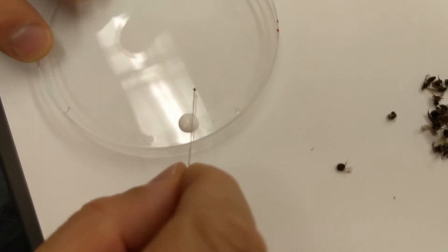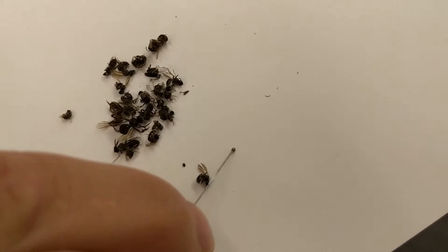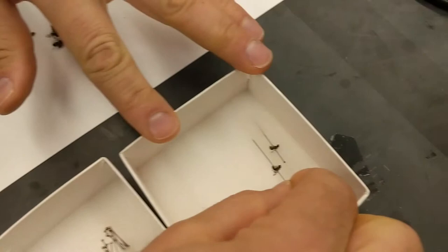Let's do a few more just so you can see the process. I'm going to roll a small amount of glue onto the pin, then I'm going to flip a specimen over so it's on its left hand side. Then I'm going to put the tip of the pin on the surface and just press the glued part onto the side of the specimen.